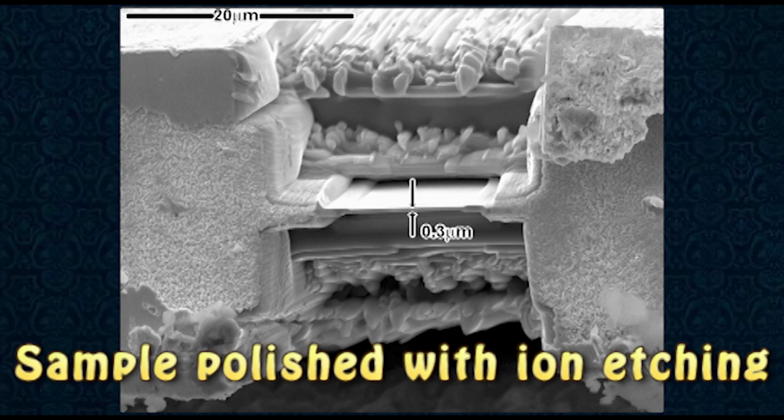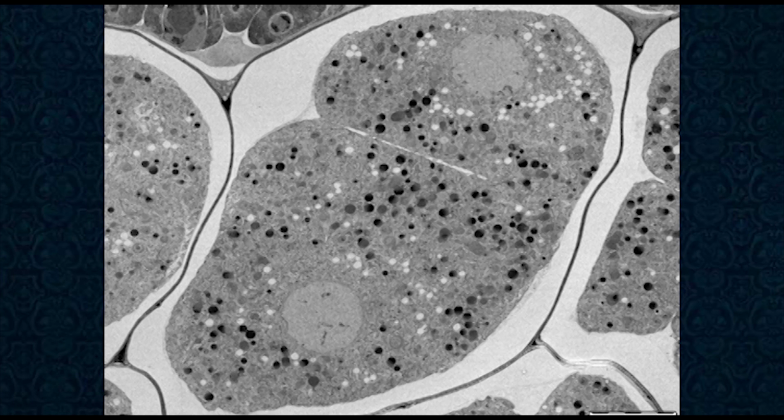methods previously mentioned. For biological samples, sometimes staining the specimen will produce a more detailed image. Compounds of heavy metals such as osmium, lead, uranium, or gold can be utilized in order to more effectively absorb or deflect the electrons being fired at the sample.